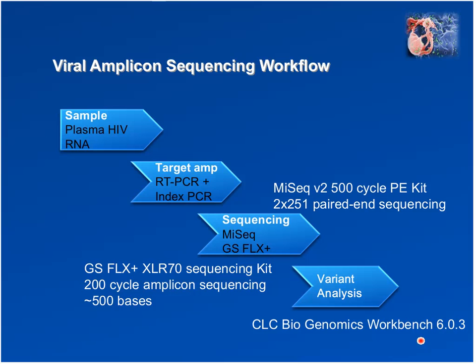That's for all the sequencing kits and indexing kits, etc., put together. One run on the MiSeq for that amplicon library costs us $1,500. So if you want a very quick calculation, for 50 samples, basically it's $30 per sample, if I do that quickly in my head here.